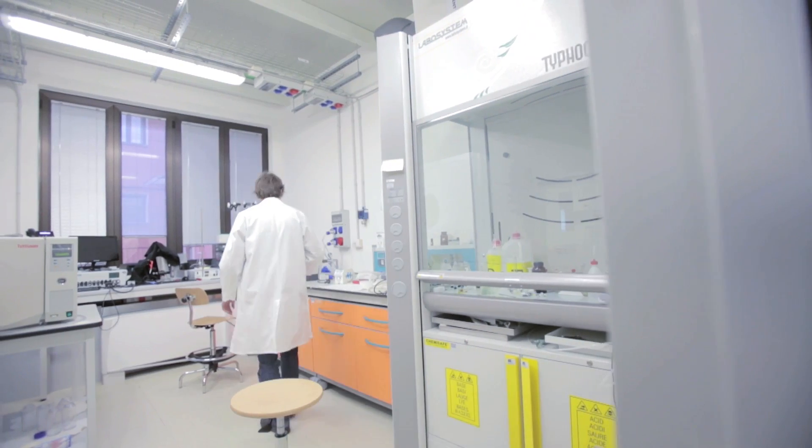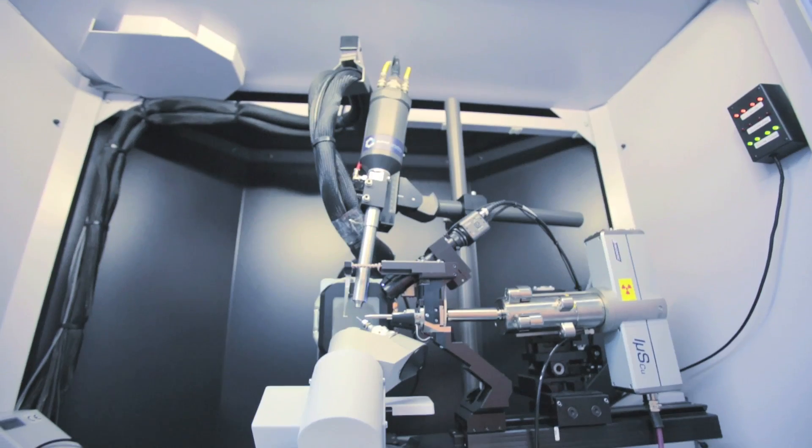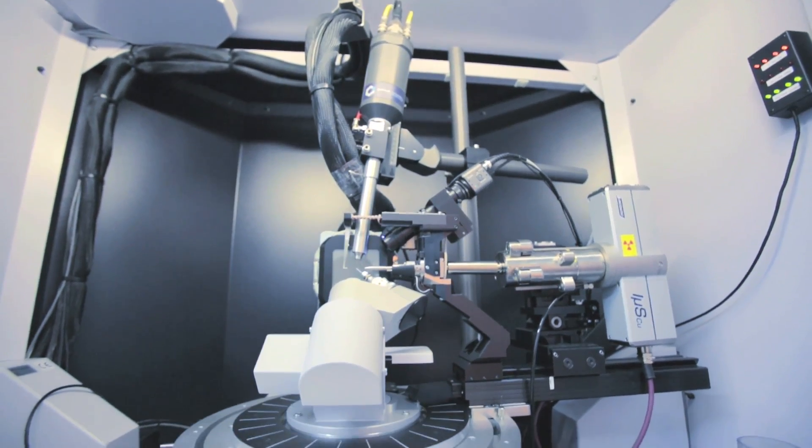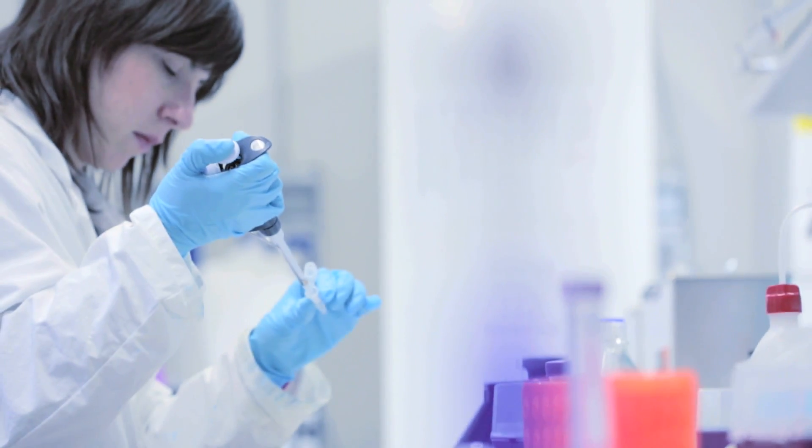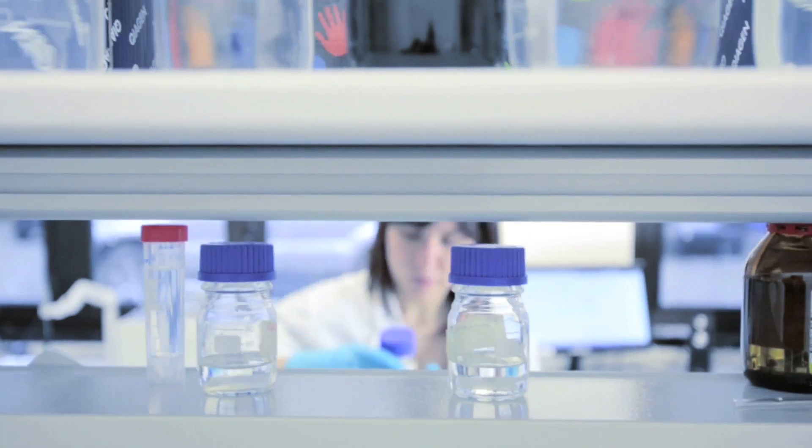In our Biochemical Laboratory, we deal with the characterization of the three-dimensional structure of proteins of interest for different applications such as drug design and the study of interactions among biological molecules.